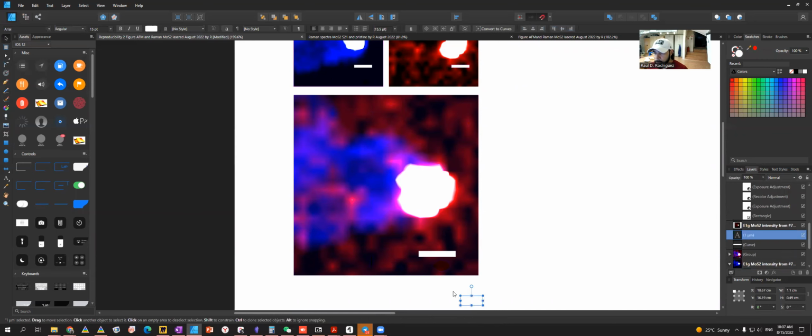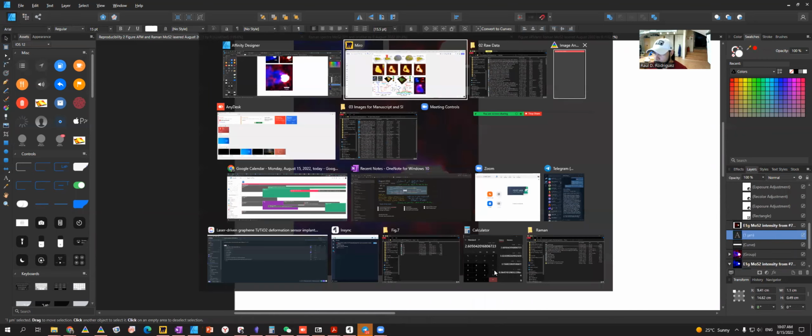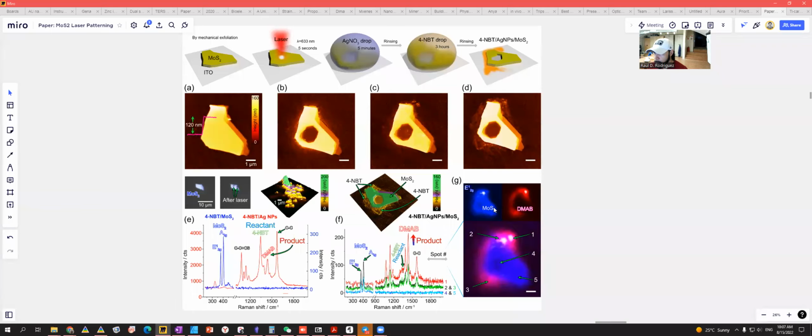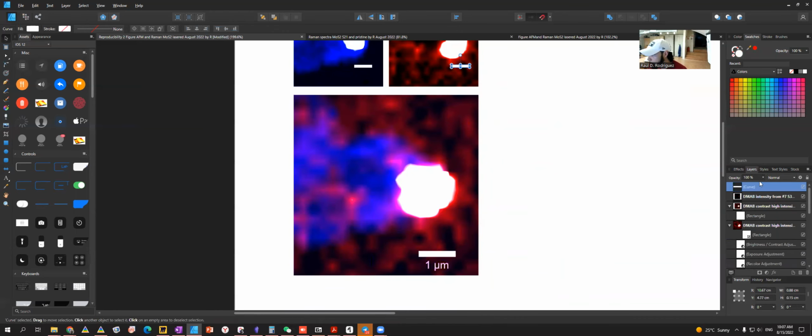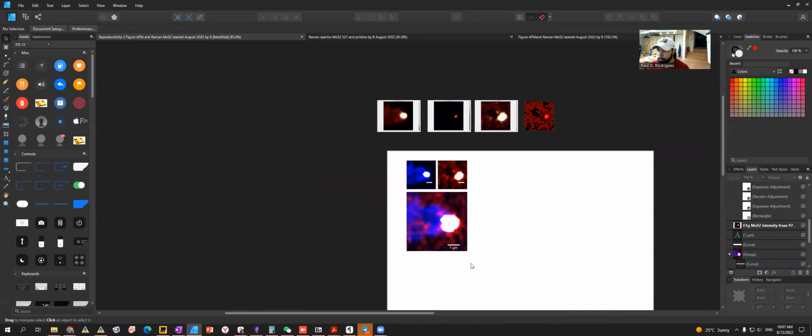I could even take this micrometer here. I think that's what I did in the original. No, I can leave it like that. In this one, it has 0.15 height. I just want the width to change. I don't want everything else to change. Okay. Closer. That's it. That's how we have our image.